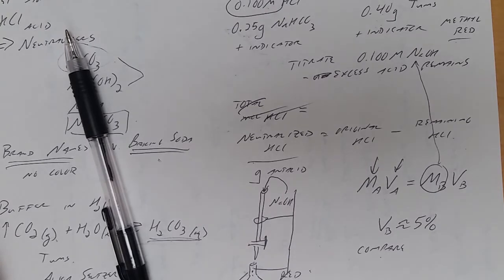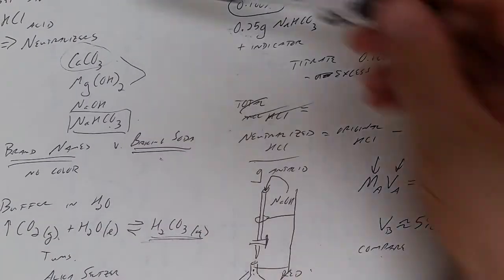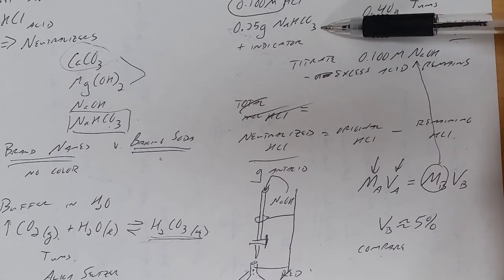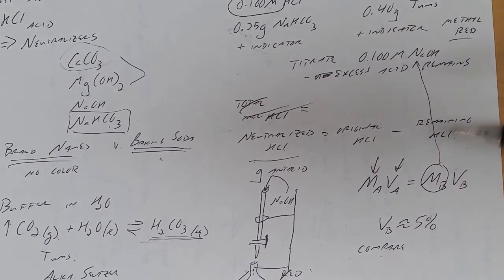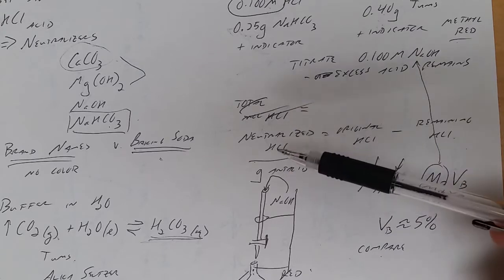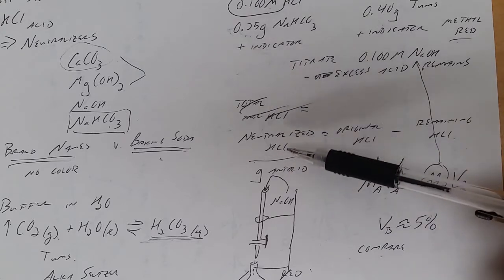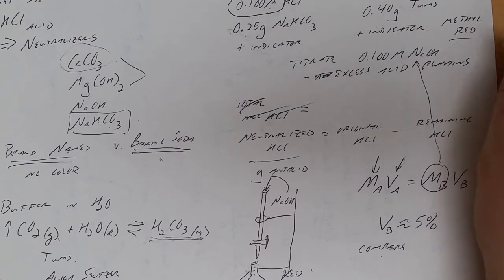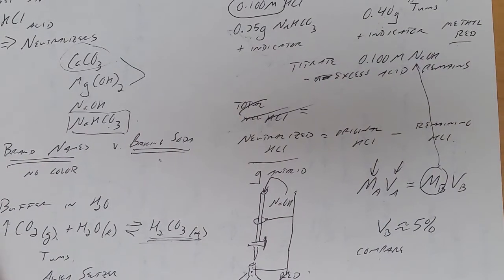Okay, so that concludes our lab discussion for antacid analysis. We'll be simulating some stomach acid, adding an antacid to neutralize the acid, measuring how much acid remained after we added the neutralizer, and then comparing the buffering capacity of one to the other. And so you'll be calculating that today based on the videos that you watch. Good luck in lab, stay safe, and buy wisely.